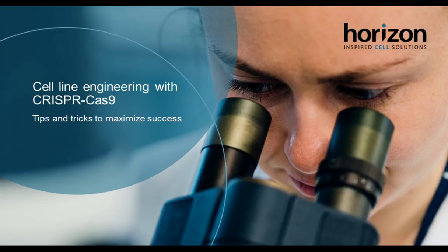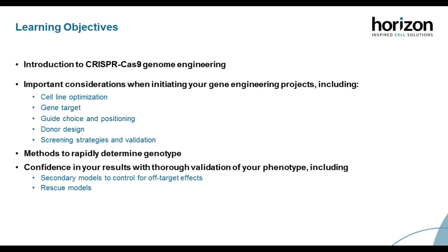So I'm just going to dive straight into the learning objectives of this webinar and what I aim to cover. We are going to run through important considerations to make when initiating your gene engineering projects. These will include cell line optimization, considerations about your gene target, guide choice, position, and donor design. And finally, we're going to talk through different screening strategies and validation techniques that will help you find the important resultant clones.